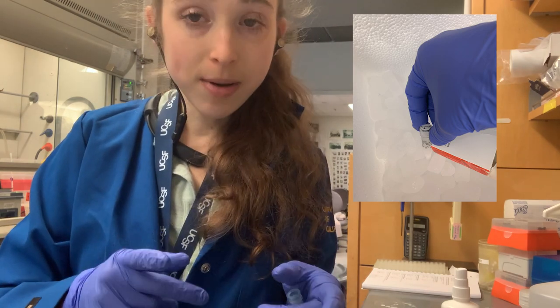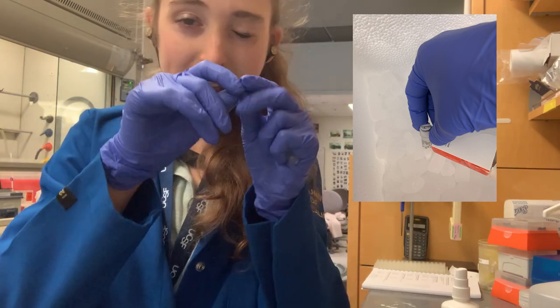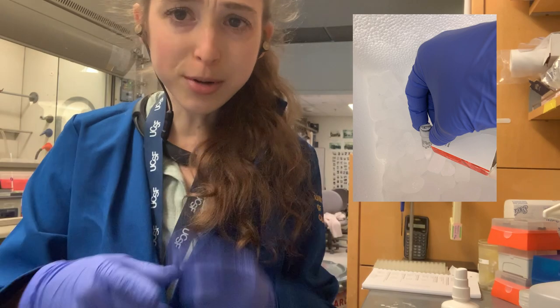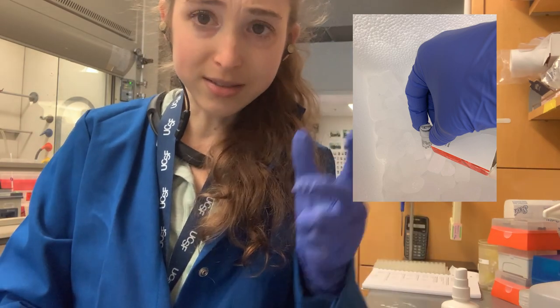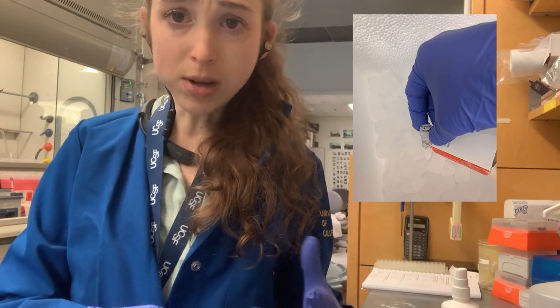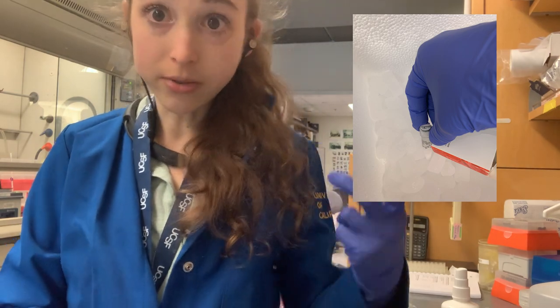Unfortunately I learned the hard way that sometimes the lot number on the side of the tube corresponds to just the tube component. When you go to the site to try to look up a lot, it says you must use the lot number that was on the kit box — but you've already thrown away the kit box.